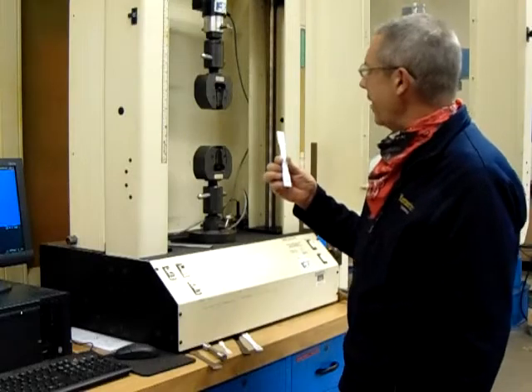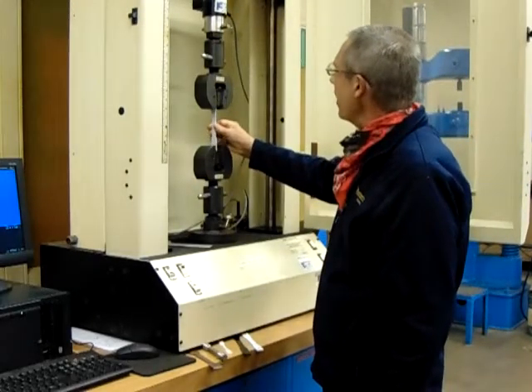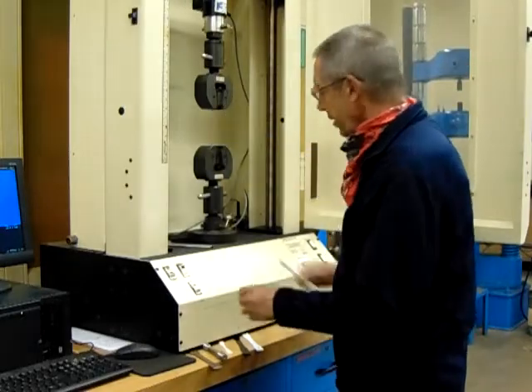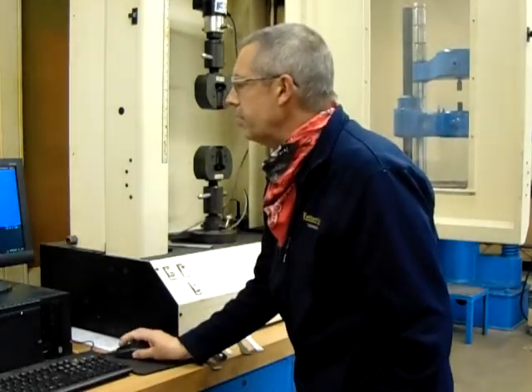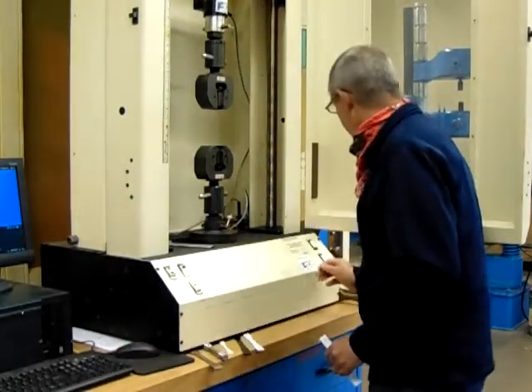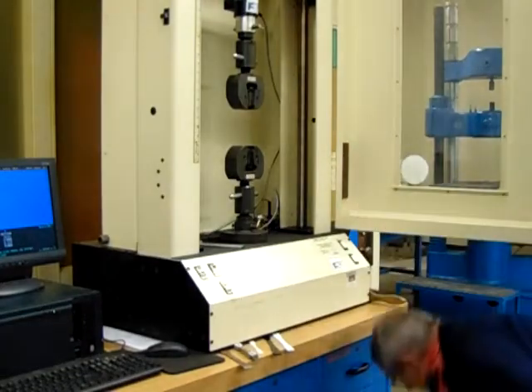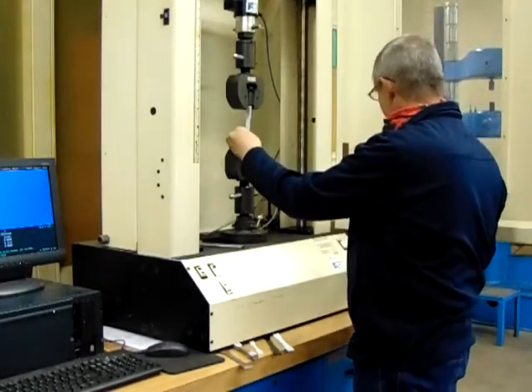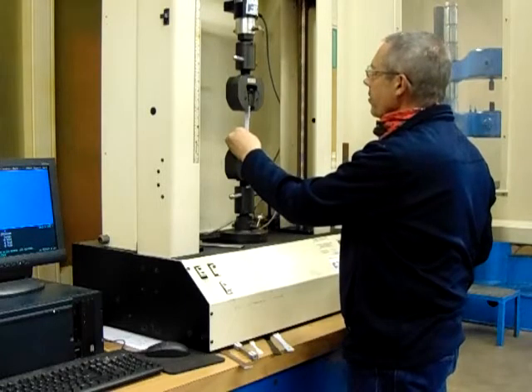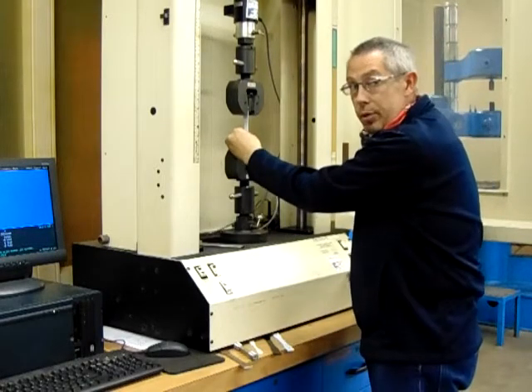We're going to do the one that was printed in the X direction. It's not quite going to fit in our jaws, so we need to go to the jog position in our machine here, and then we're going to pass the drop test.